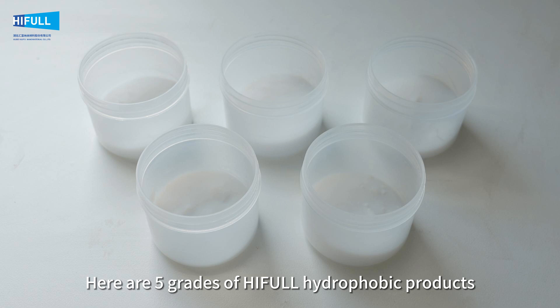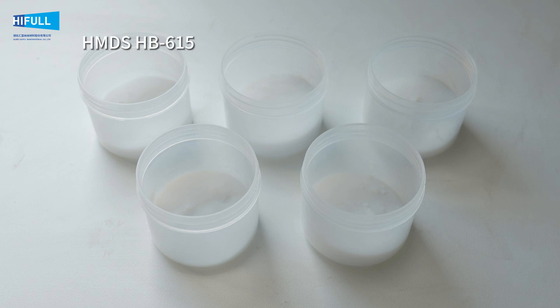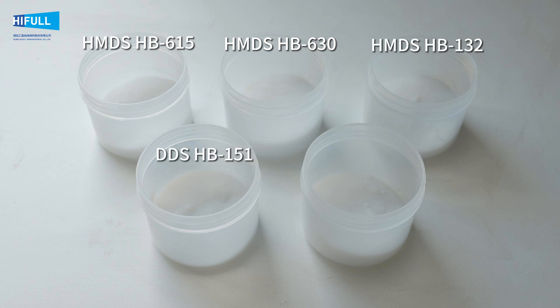Here are 5 grades of HIFULL hydrophobic products, modified by 3 different treating agents: HMDS-treated HB615, HB630, HB132; DDS-treated HB151; and PDMS-treated HB139.